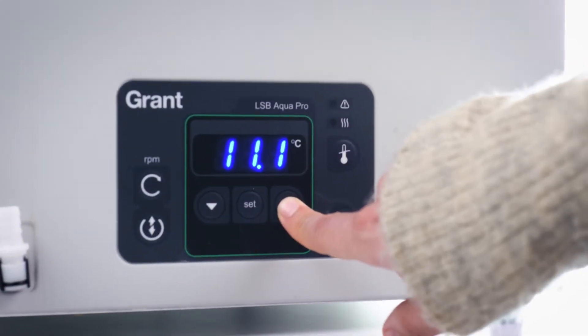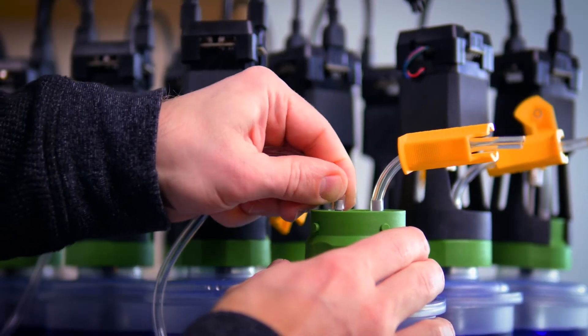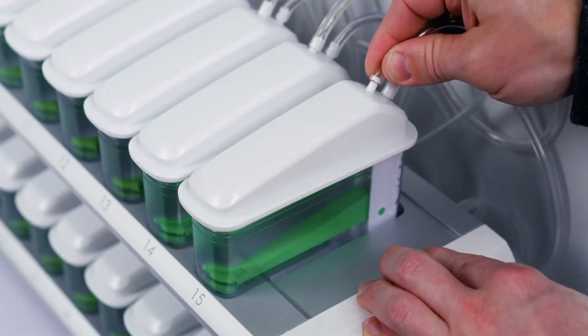Set your desired incubation temperature with a thermostatic water bath. On top of the incubation bottles, tubes are easily connected to transport the gas to the other parts of the instrument.